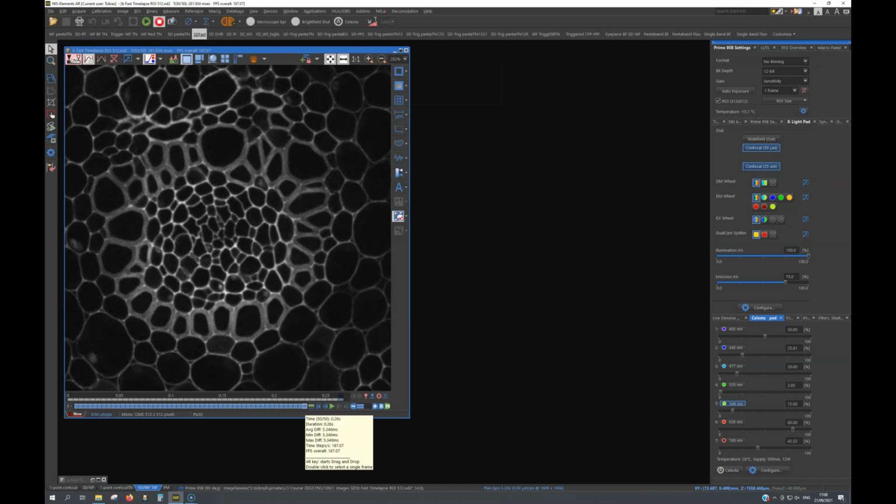The total acquisition time is 262 milliseconds, resulting in a frame time of 5.3 milliseconds for our region of interest. Compared to the frame time of 16.2 milliseconds for the full frame, our region of interest only takes 1/3 of the time to image. But when we only expose for 1/3 of the time, our signal-to-noise ratio should be worse as our signal is smaller because we collect less photons.